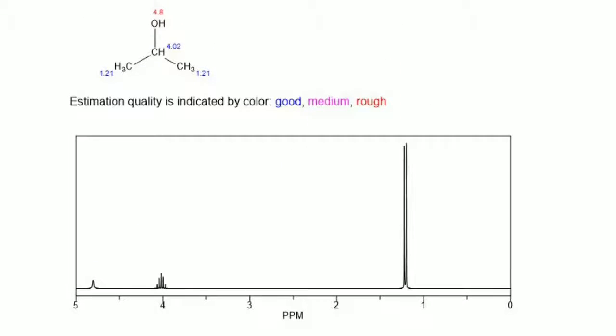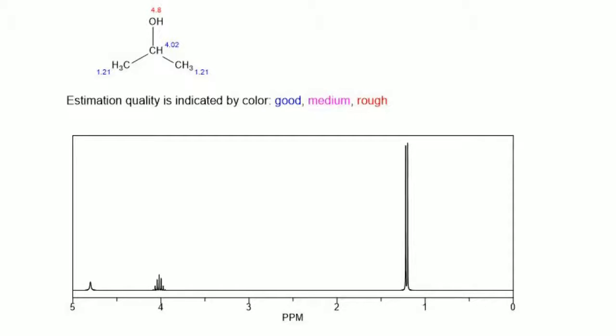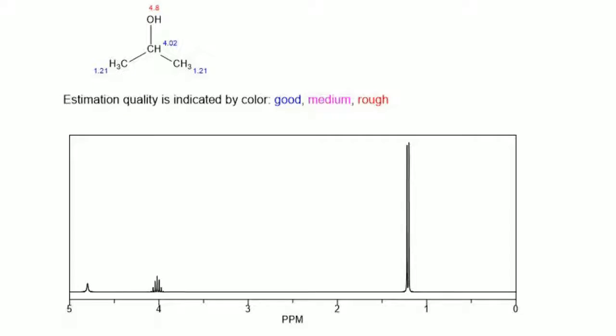In the predicted NMR spectrum created on ChemDraw, it is seen that the peaks are nearly identical to the peaks in the NMR spectrum that was tested here at the U of A. The lowest peak is a doublet near 1.2 ppm, and there's a peak with 7 splits slightly above 4 ppm. The only difference between the two is that the simulated ChemDraw NMR has shifted the peak corresponding to the OH bond to near 5 ppm.